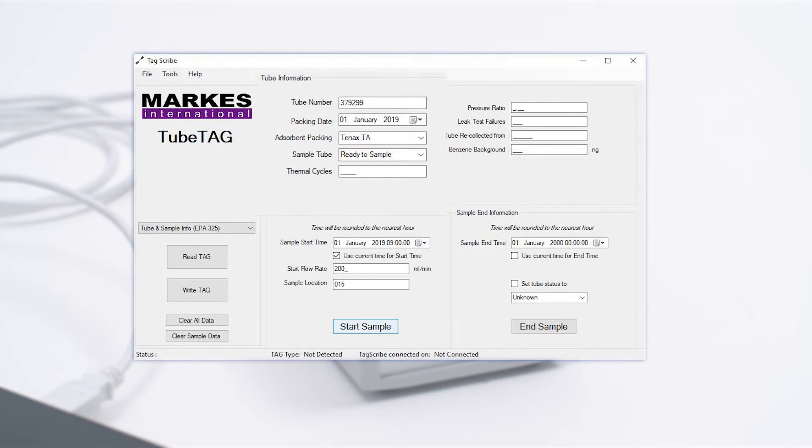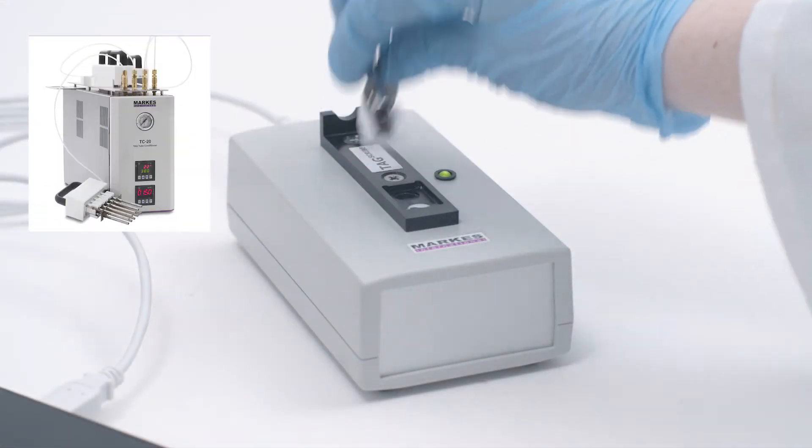In the software, populate the tube number, packing date and adsorbent packing fields and click Write Tag. You are now ready to condition your tube.